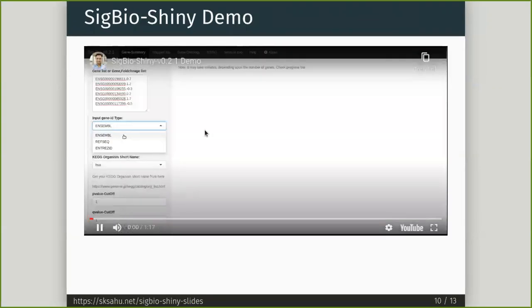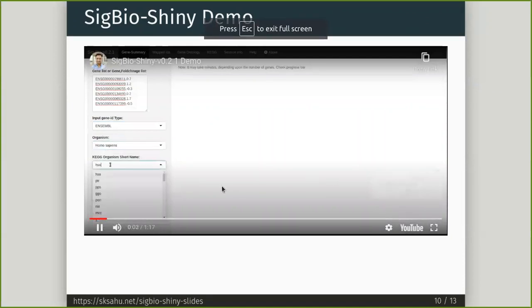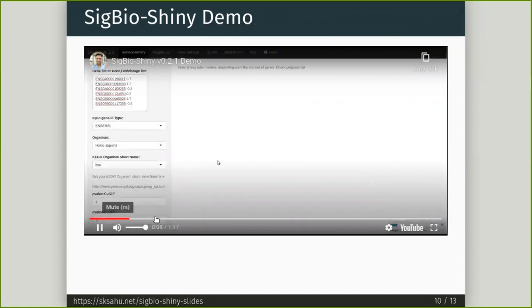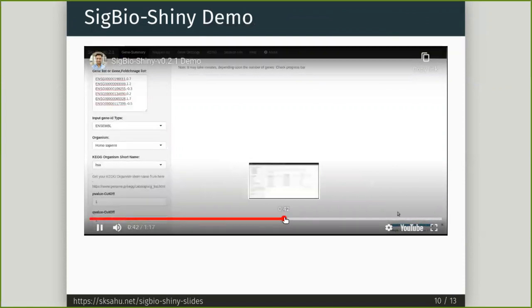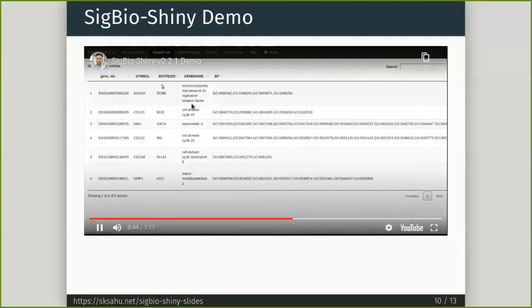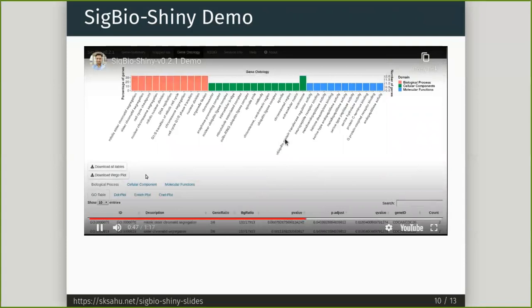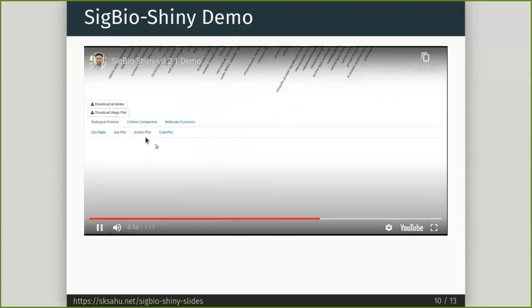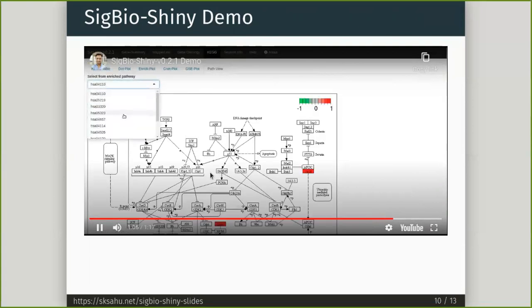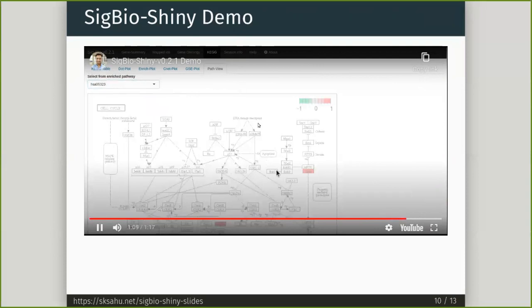Let's consider a demo. Here, this is how you input your gene list and organism, then you submit. It takes a while to download the database and do the background calculations. It then shows how many genes passed ID mapping, different kinds of Gene Ontologies and respective plots. The same goes with KEGG pathways, and using the Pathview package it visualizes your genes on KEGG pathways.